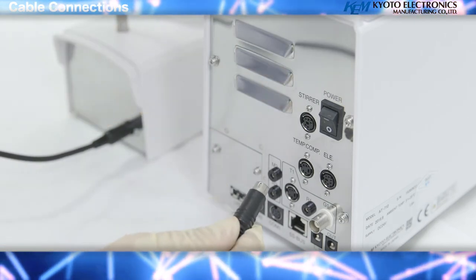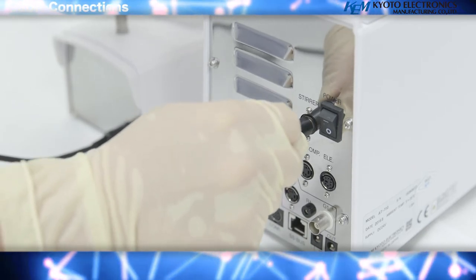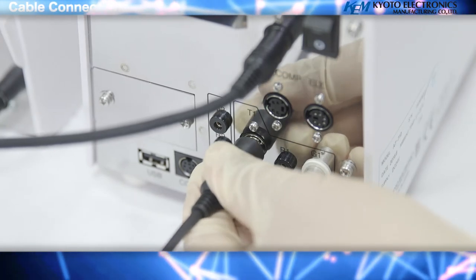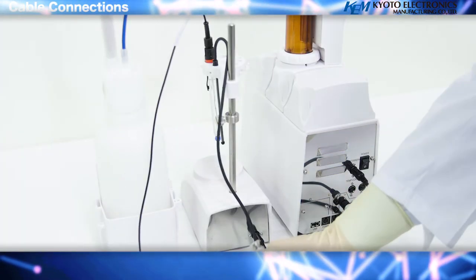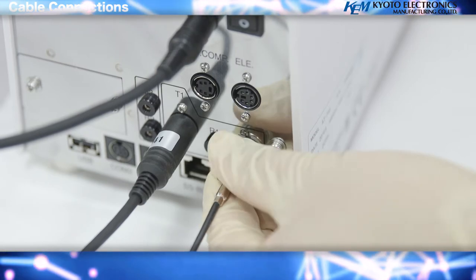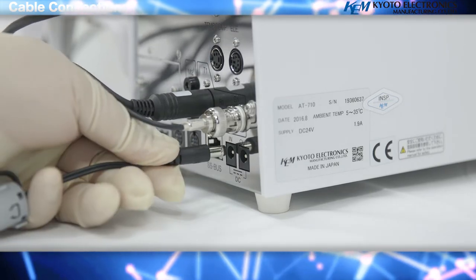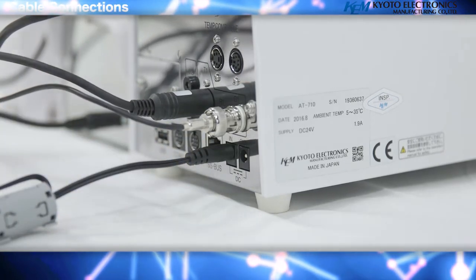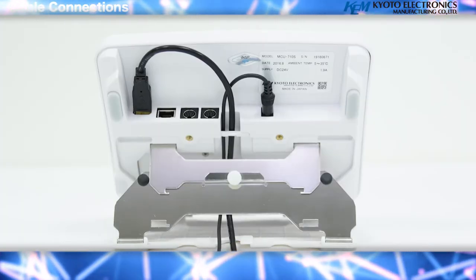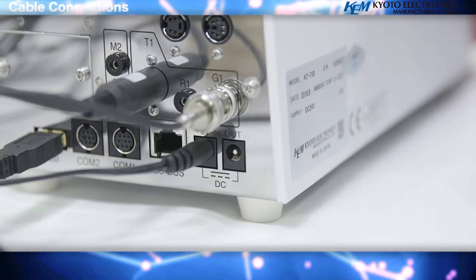Connect the magnetic stirrer to stir the sample solution. Connect the electrode lead to the pre-amplifier on the back of the main unit. After inserting the connector, turn it around to lock it into the G1 terminal. Attach the power cord to the AC adapter and connect the connector plug to the in-power connector slot on the back of the main unit. The USB connector is used for storing measurement results; connect a USB memory stick to record and save the method.